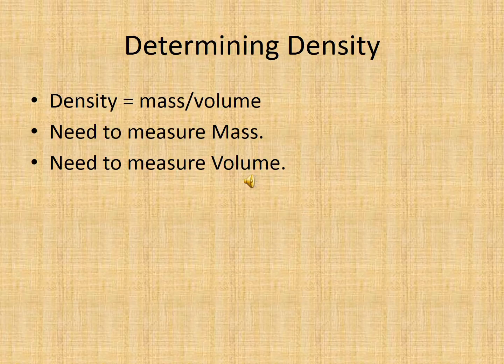Just a quick review. What is density? Density is mass divided by volume. So, if we're going to measure the density of an unknown object, we're going to need to measure the unknown object's mass, and then we're also going to need to measure its volume.